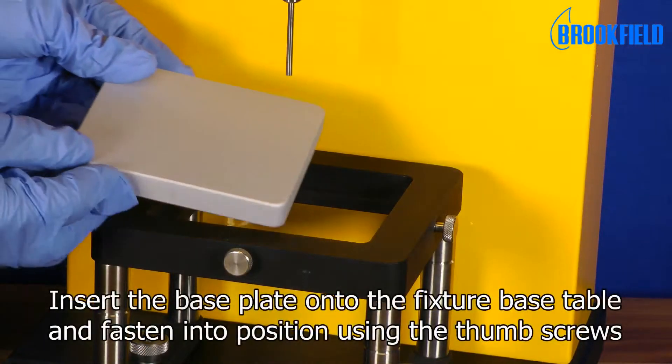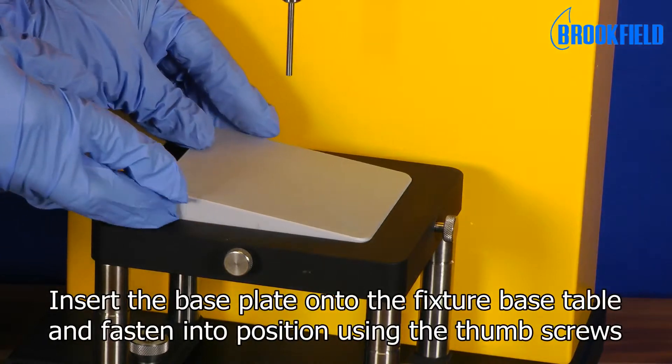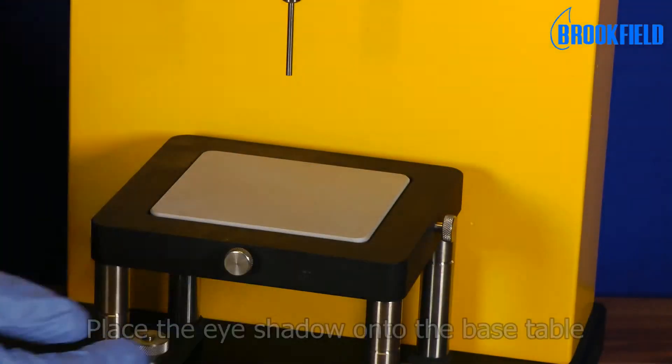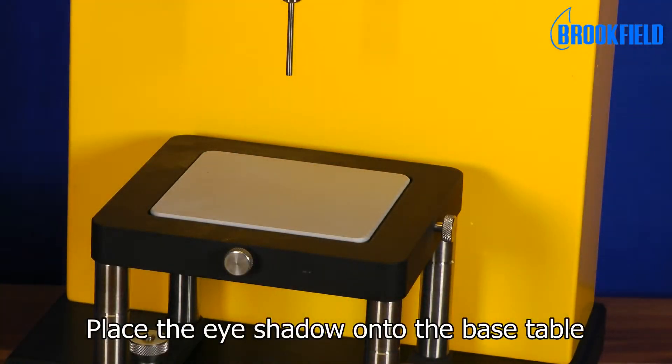Insert the base plate onto the fixture base table and fasten into position using the thumb screws. Place the eye shadow onto the base table.